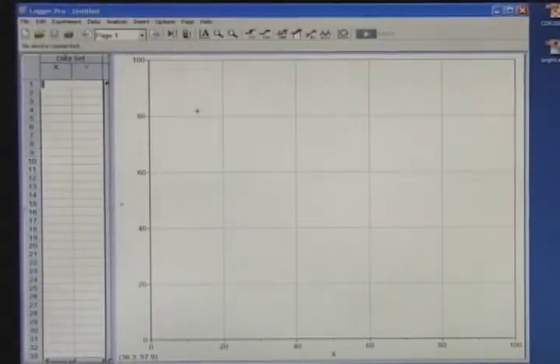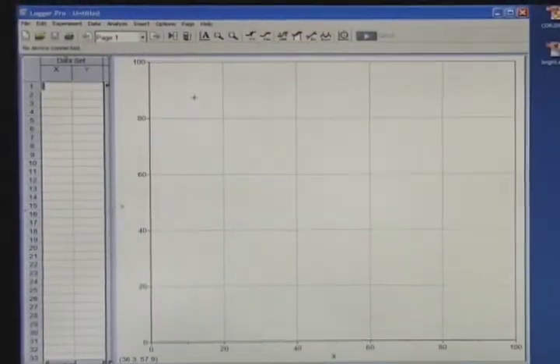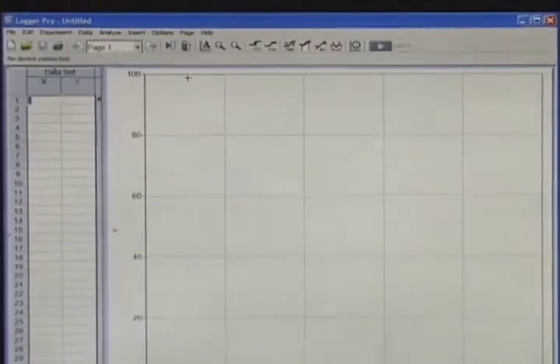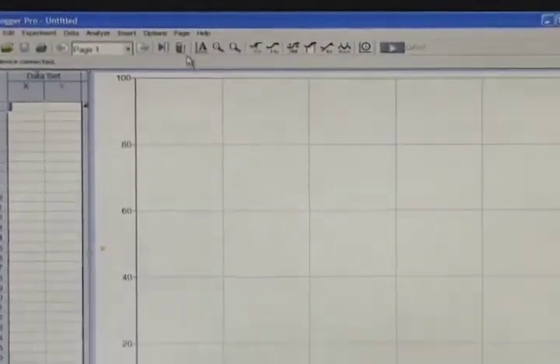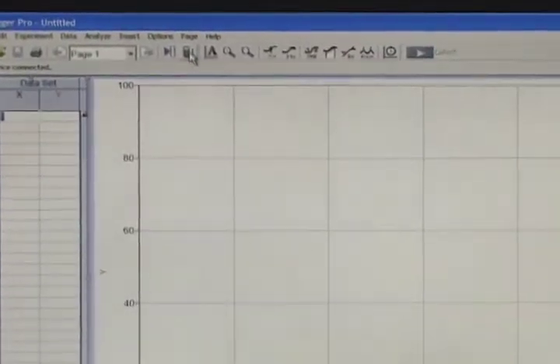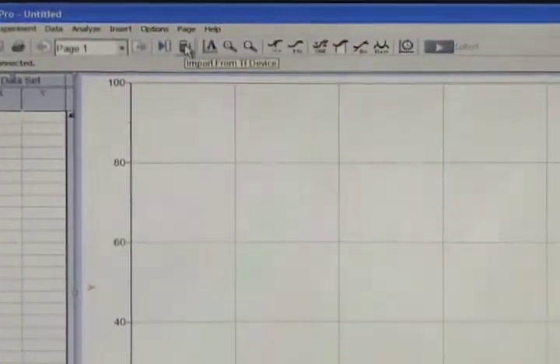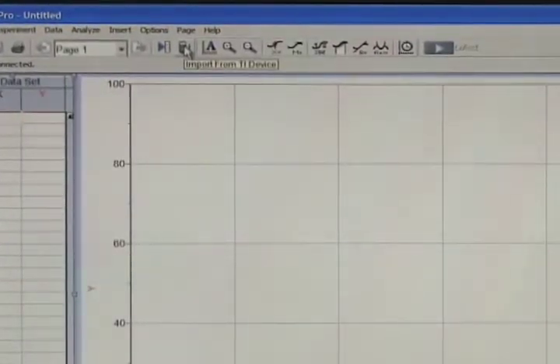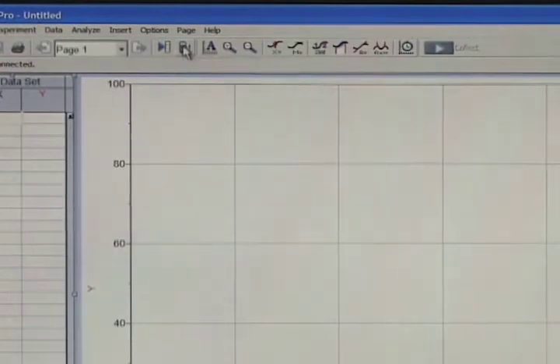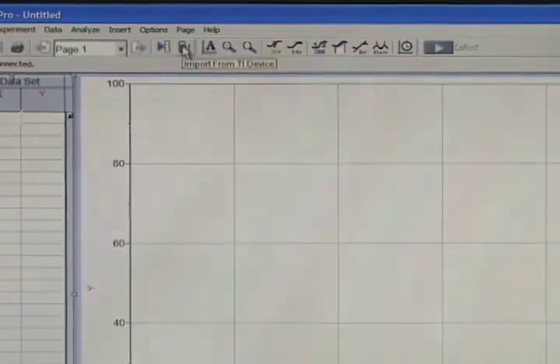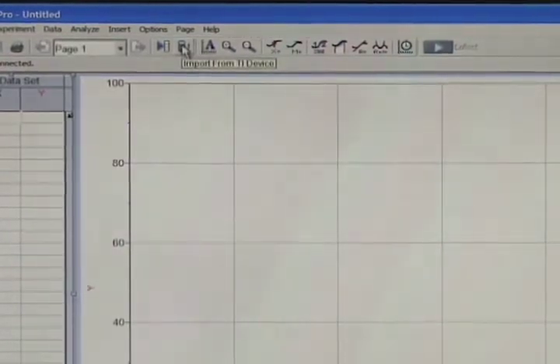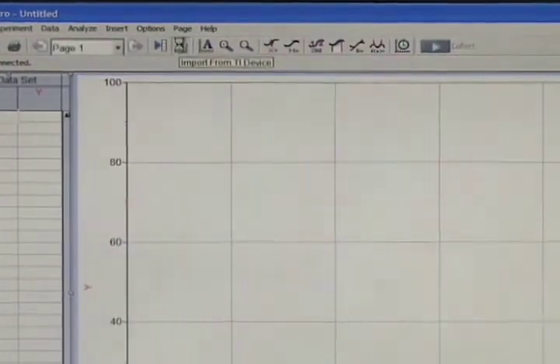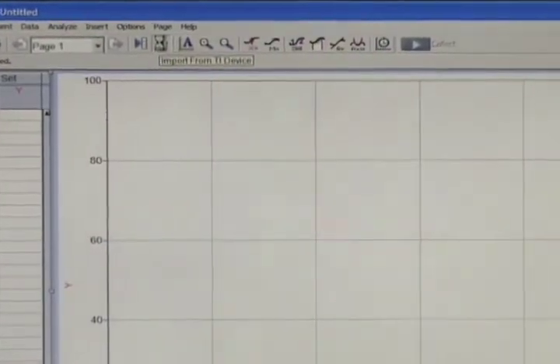Now I'll start the LoggerPro software and we'll see how to get the data in there. To import it, we will click the button that has a calculator on it. Hover the mouse over it. Notice that the pop-up says Import from TI Device. Click that button.